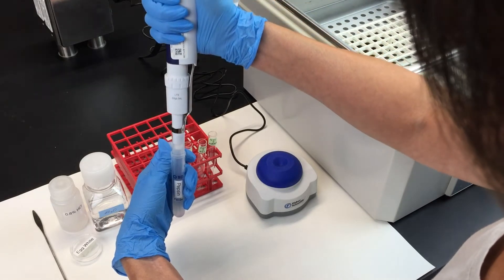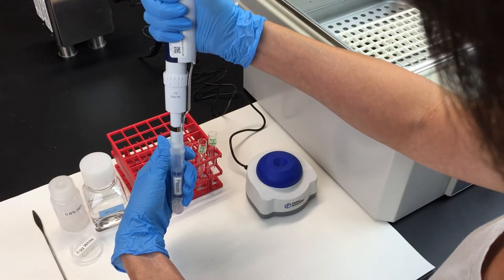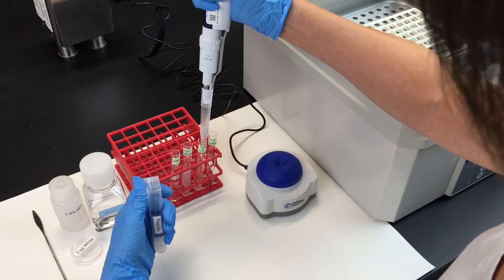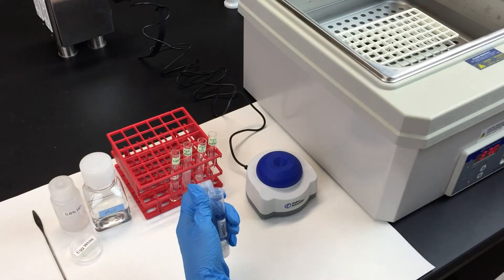The third test tube will have 2.5 milliliters of pepsin and 2.5 milliliters of a dilute hydrochloric acid solution.